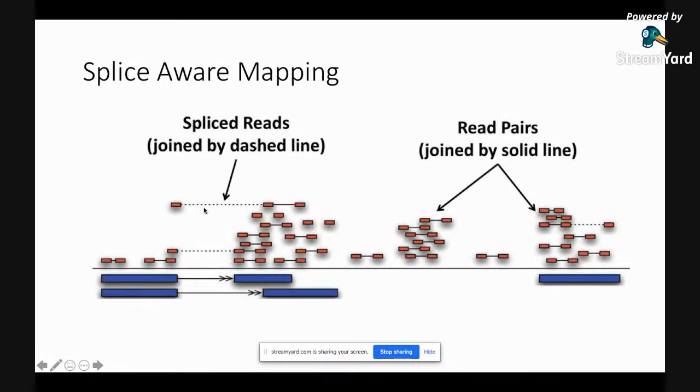But it could be that one of the reads is in one exon and the other read is on the other exon, right? Then they lie far away on the genome. Or it could also be that within a read is where the splicing is happening, the site of splicing. So half of the read lies in one exon, then it's split, and then the other half of the read lies in another exon, right? And then you get your other end of the sequence.